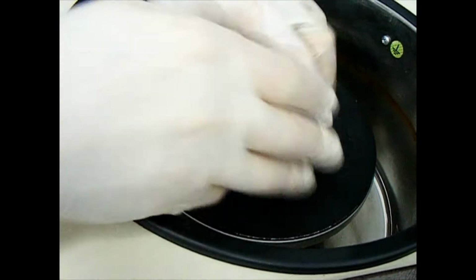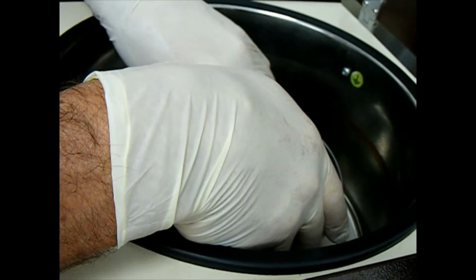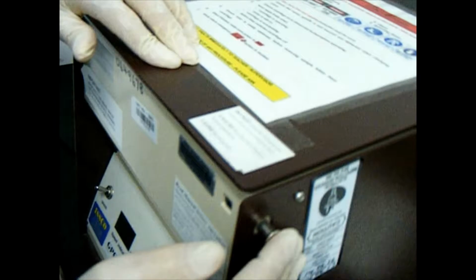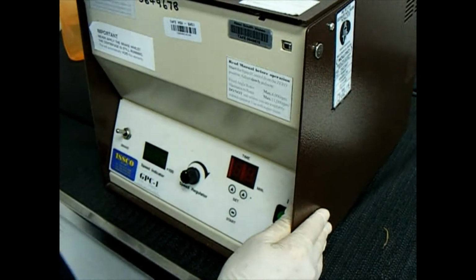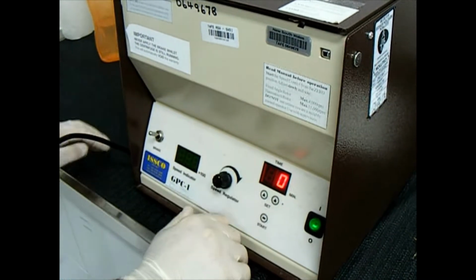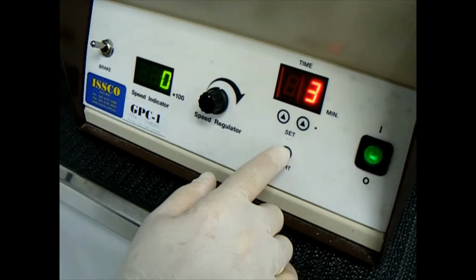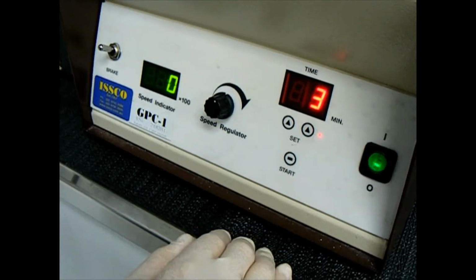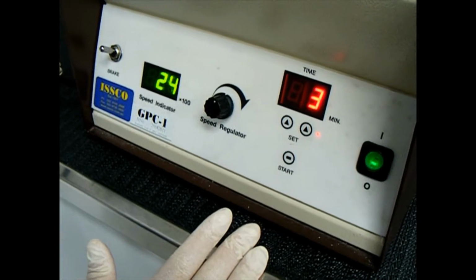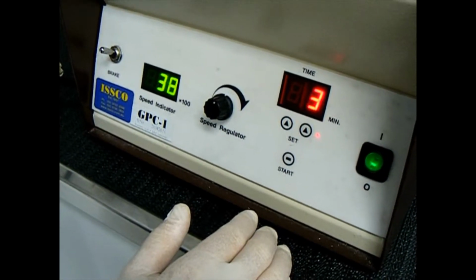We put the lid on. I close the lid, I lock the lid, I turn the power on, I set the speed, and I'm going to set this to 3 minutes. It's going to spin down. At TAFE, always the teachers will spin the centrifuge down. You can load the centrifuge, but please don't spin it down without a teacher.